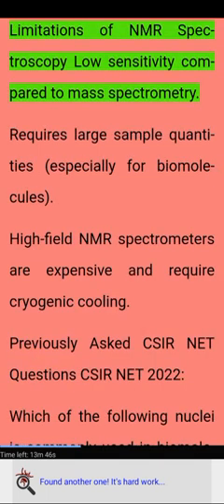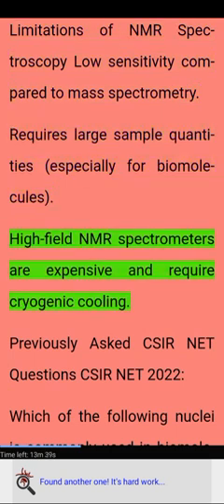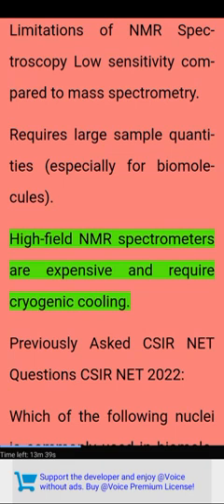Limitations of NMR spectroscopy: low sensitivity compared to mass spectrometry. Requires large sample quantities, especially for biomolecules. High-field NMR spectrometers are expensive and require cryogenic cooling.